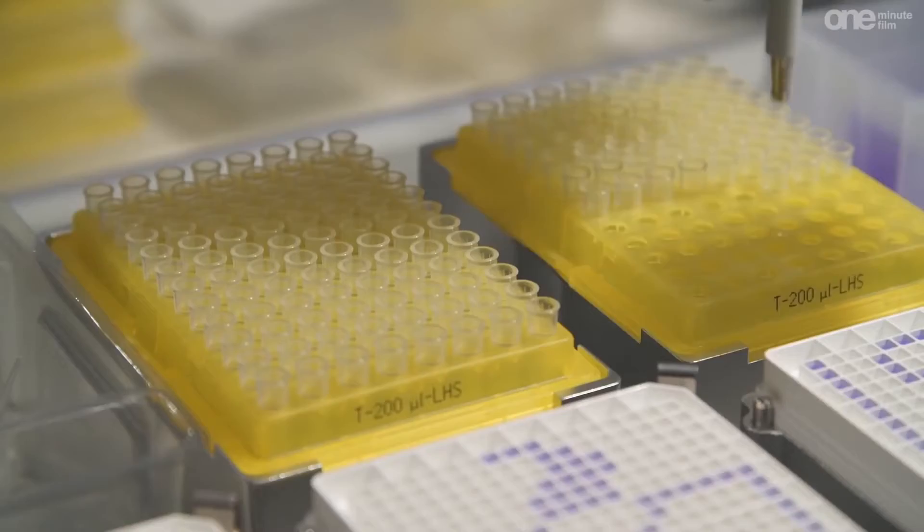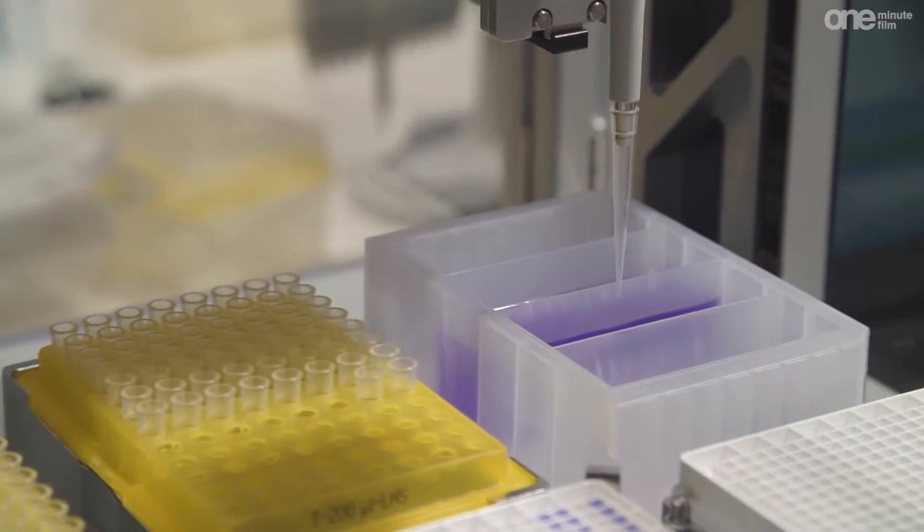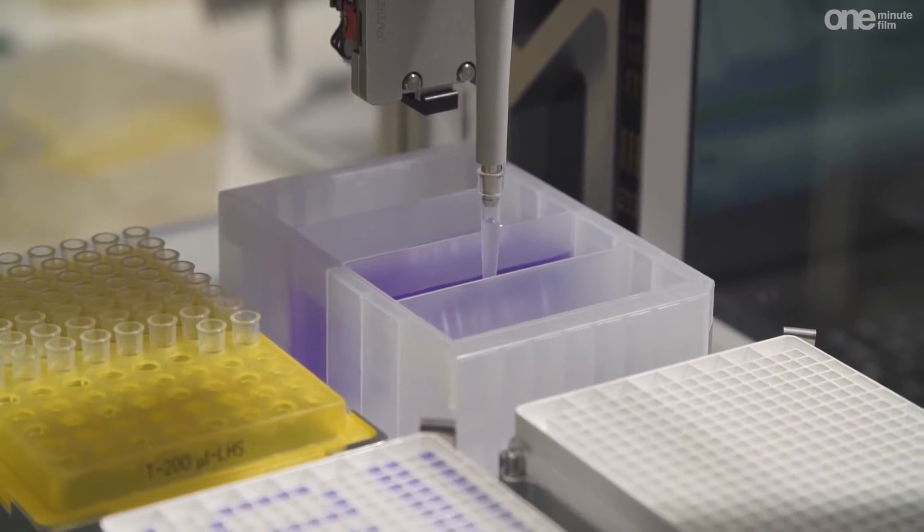The liquid handling station is often used in biological sciences and in pharmaceutical applications that have small or medium-sized projects.